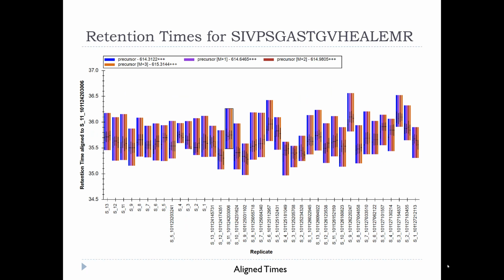And now if we run an alignment, we use all those regressions and those linear equations to translate between replicates. This is just translating everything to one certain replicate, S11306, an arbitrarily chosen replicate. If we do that translation, we have a regression, a linear equation, y equals mx plus b. We just take every x here and plug it into the linear equation, and now all of a sudden, you just cannot see that change.